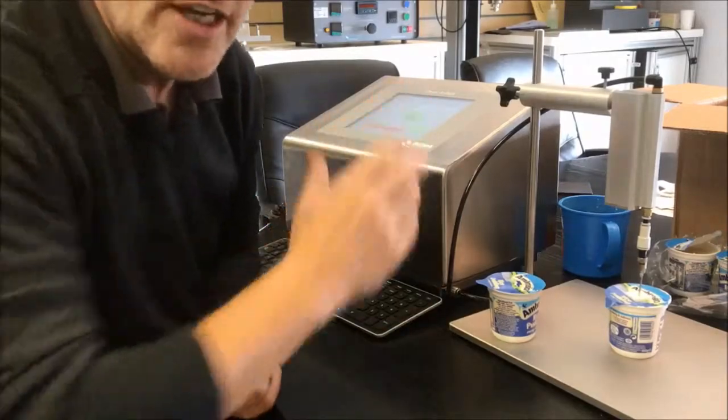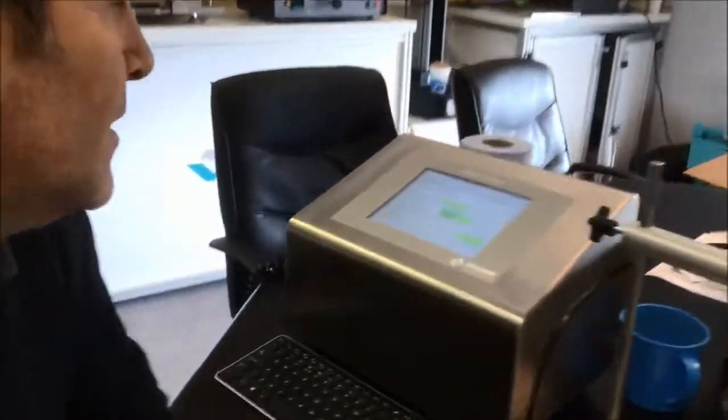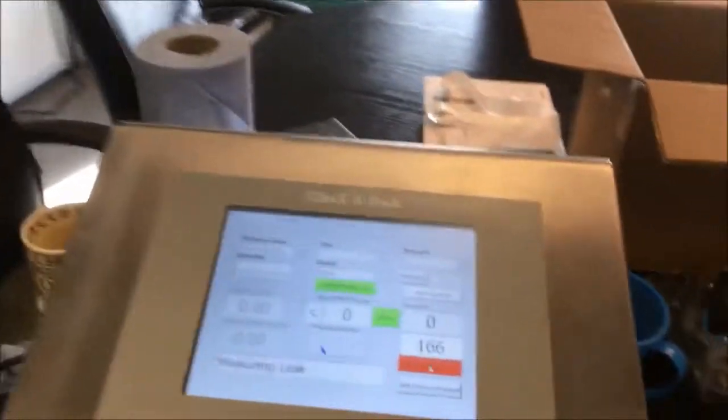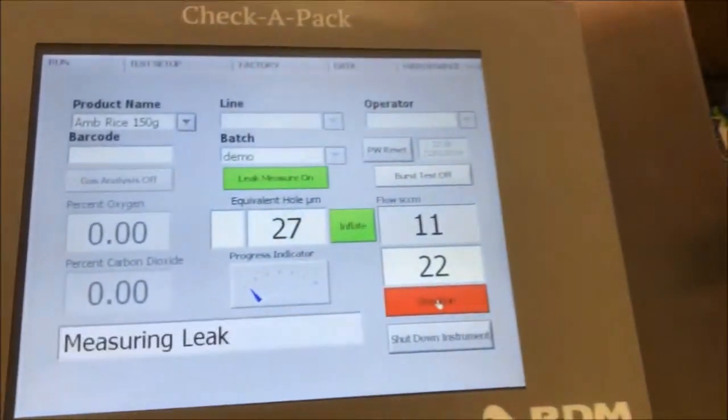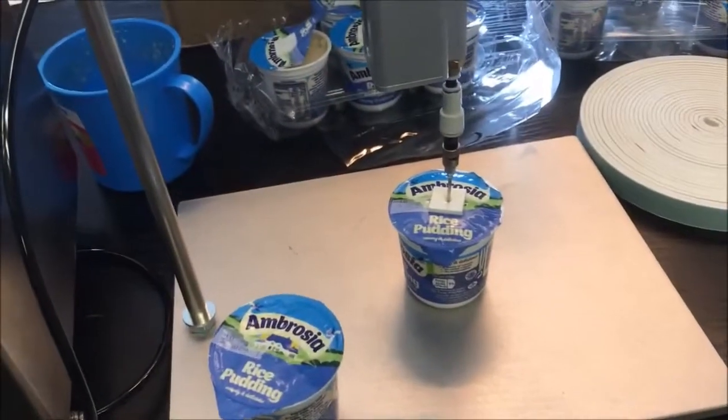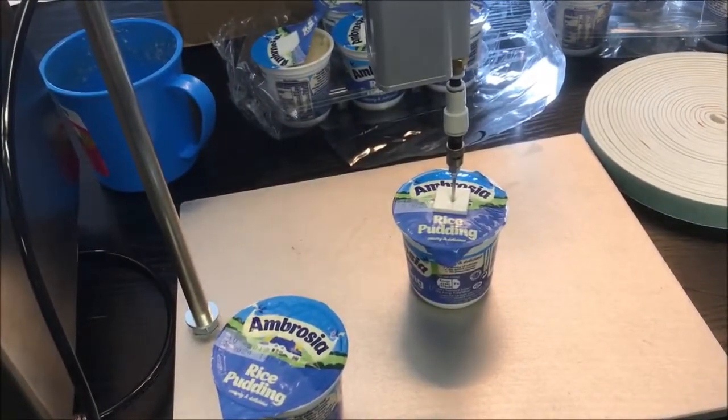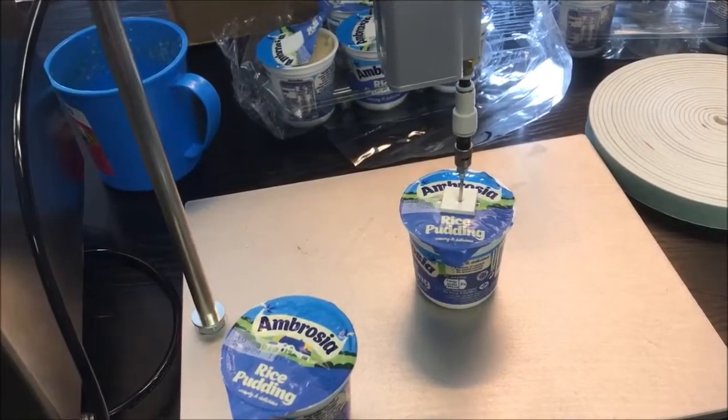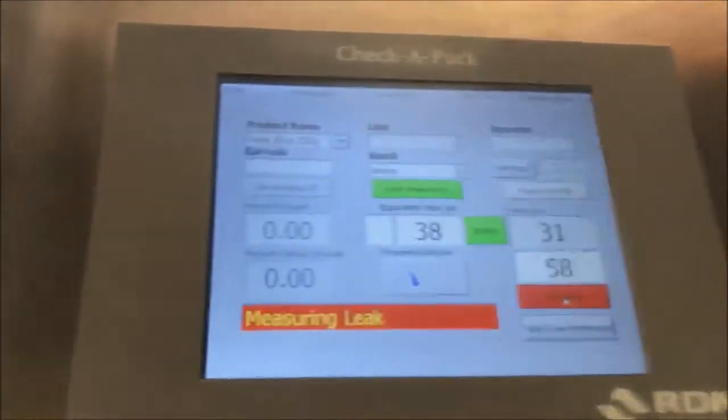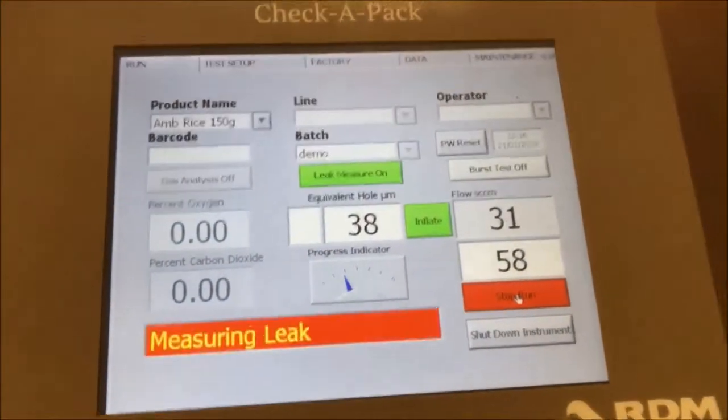On the Checker Pack, I've already got it set up to do a leak test, but let me show you what's going to happen. We'll press the start button on here and you'll see the pack over here is inflating. We're taking it up to a pressure and then we're looking to see what airflow comes out of the seals or any pinhole leaks that are present in that pack.